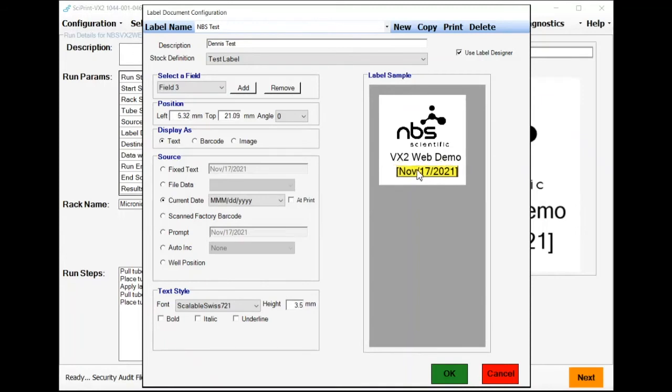So the software is very easy. There is no limit to how many information fields you can have on there. It's just however many you can fit and however small they need to be so that you can still read them. This is also very easy to use if you're using information from a data field. You orient the fields in the position that you want them, and then there's a very easy CSV file to fill out that's uploaded to the unit with the information that needs labeled.